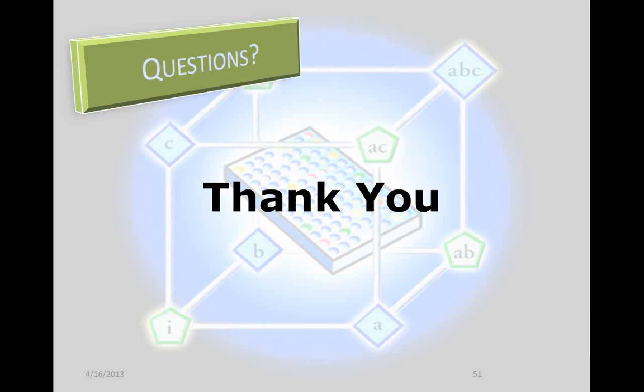What is the maximum number of variables that can be evaluated in one experiment? Maximum number of variables. There are practical limitations that will get in the way before the software will. The software will let you use any number of experiments, any number of factors, any number of settings. So you can go up to really crazy things like doing 30 different factors all at the same time in 3 different levels each. And we have customers that are doing that. That becomes kind of tricky on the analysis side, at least partially because there are a lot of interactions, and you want to be able to tease those apart as you do your analysis.